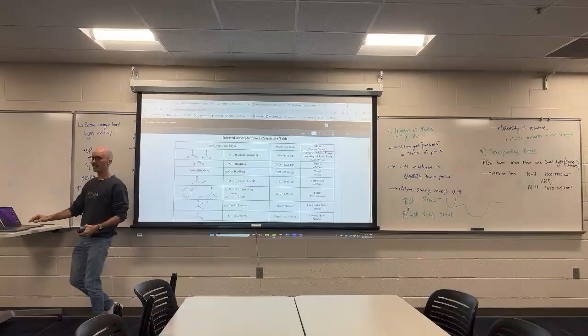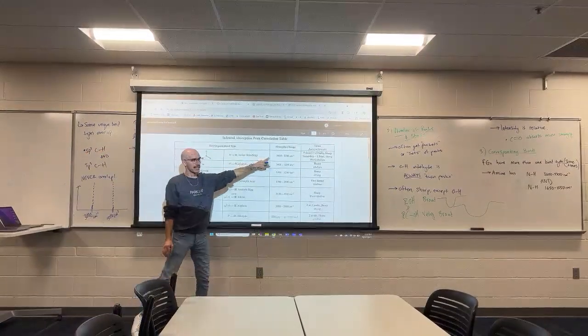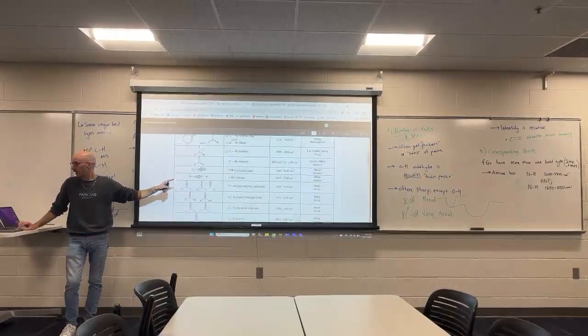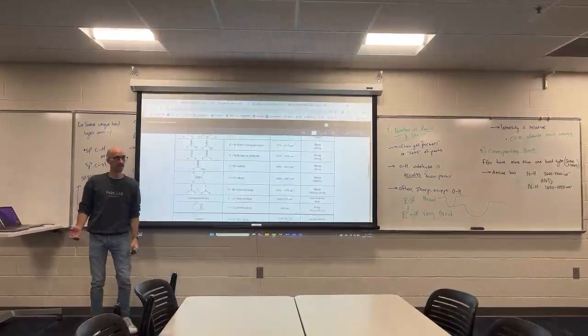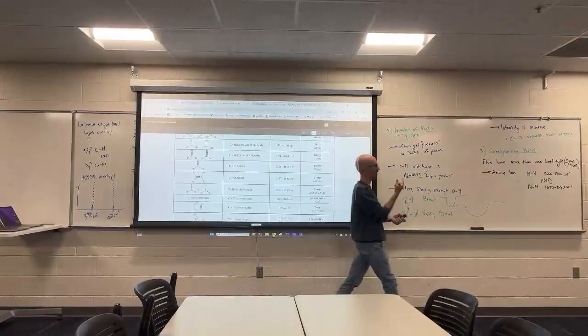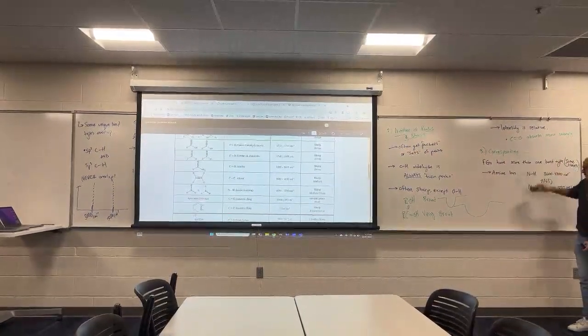If I see a signal and I want to correlate it to the NH stretch, then I must also correlate it to the NH bend. Those are corresponding, you know what, I didn't mean to say corresponding bonds. I think it's better here that I say corresponding peaks.